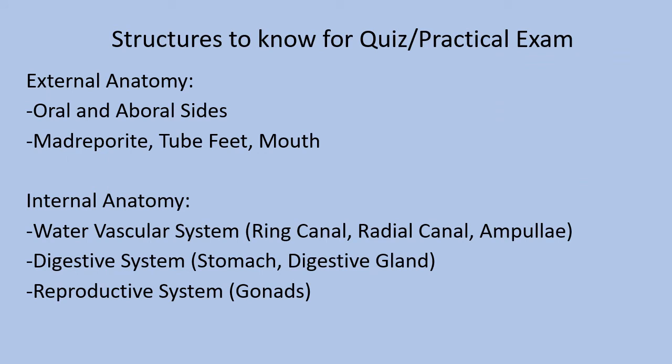So in summary, these are the structures that you should be aware of as far as the next quiz and the final practical exam, which will be online. So for the external anatomy, be aware of the oral and aboral sides, what that means. And then the madreporite or sieve plate, what that would look like, the tube feet, and then the mouth in the center of the sea star on the oral side.